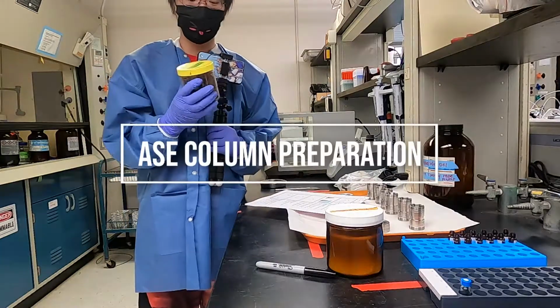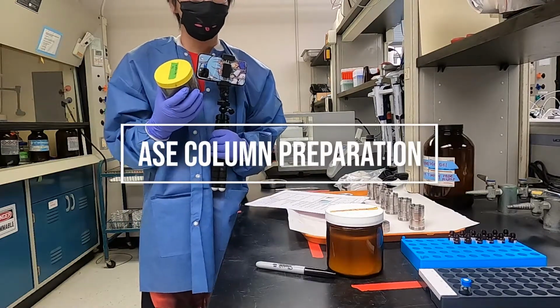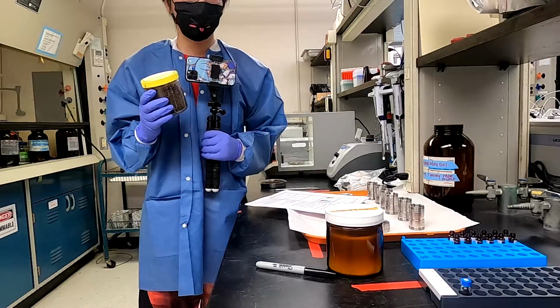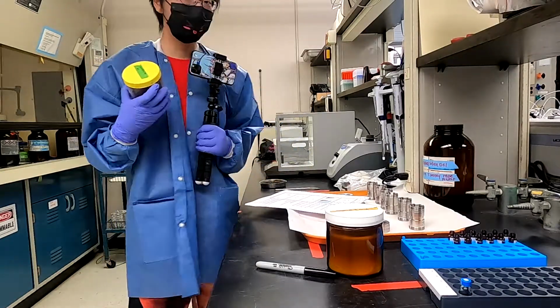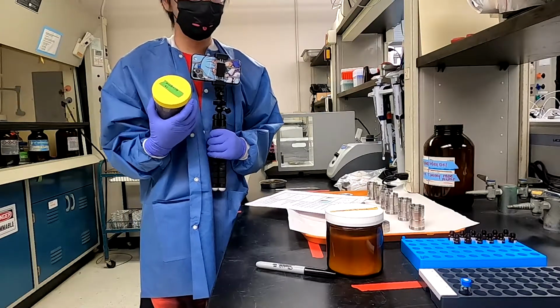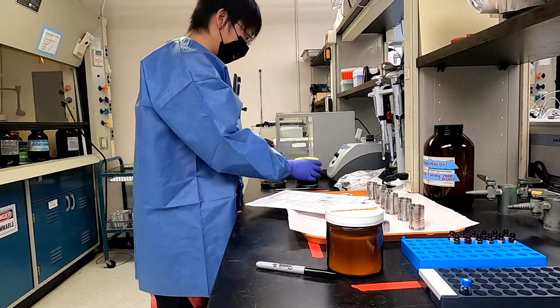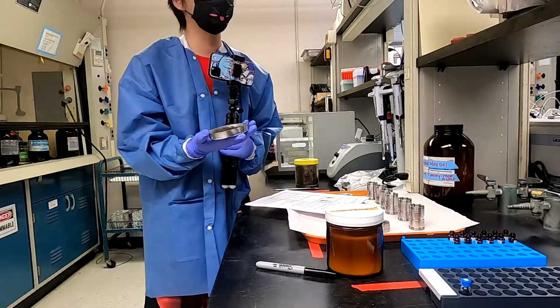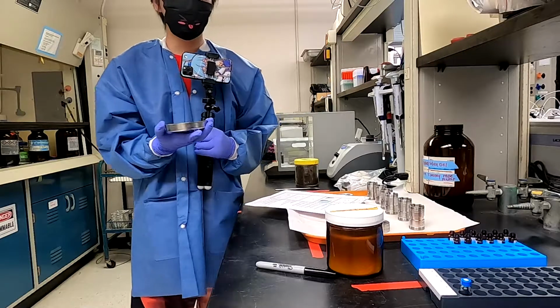So here is a soil sample that I sampled last time, and it was stored in the -20 freezer. But before we do the analysis, we need to remove all of the water from this soil sample. And here is a baked soil, and we will use this baked soil to do the analysis.